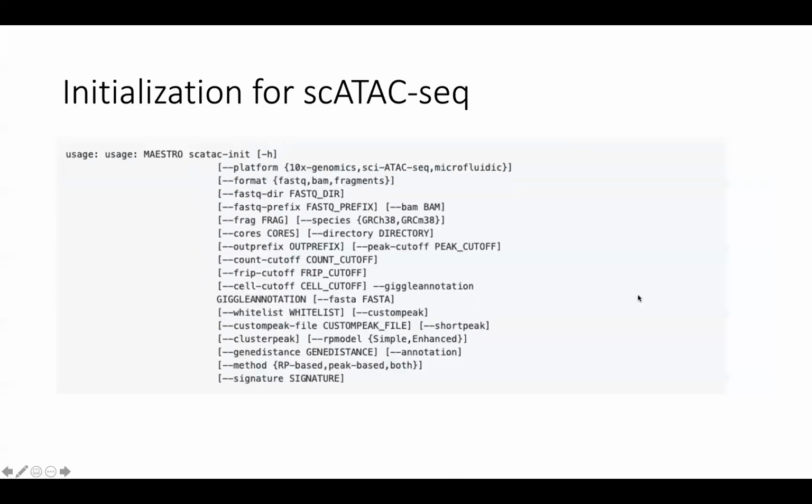And let's see. So here's single cell ATAC-seq. It's, I guess, similar in nature. 10x Genomics also does single cell ATAC-seq.